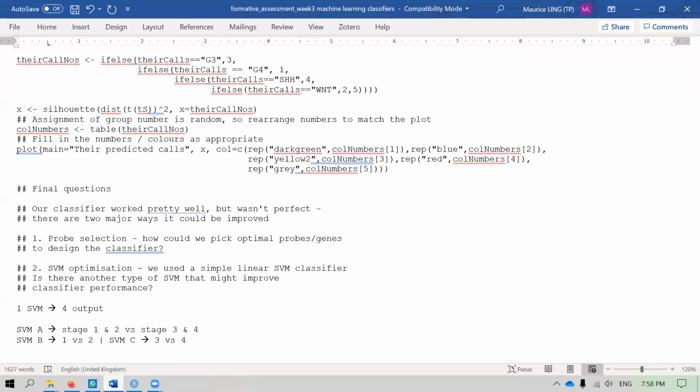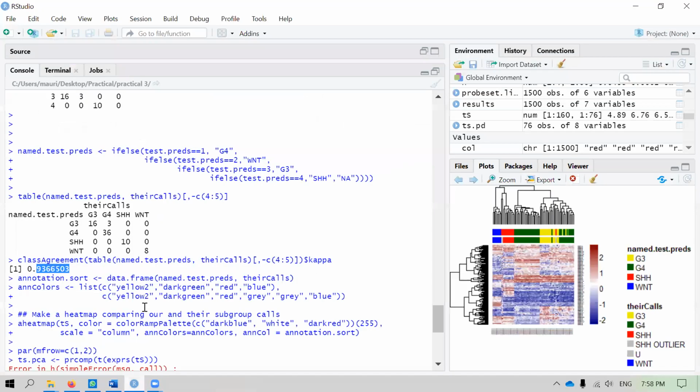You know, there are many ways of how you can play around with this. It is only effective when, let's say, our accuracy is low. But we can also use the same method. How much do you want to increase? We are actually doing 93.6, 93.7%. And really, misclassification is only 3 of them.